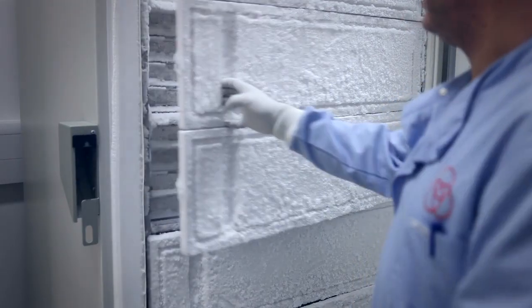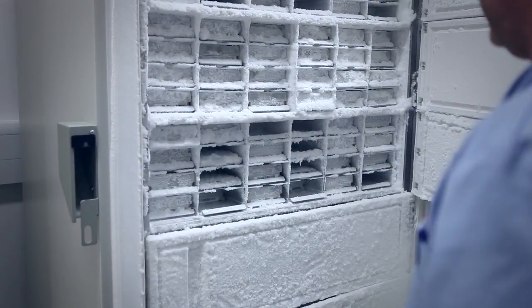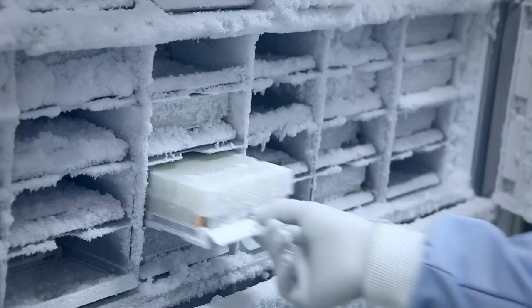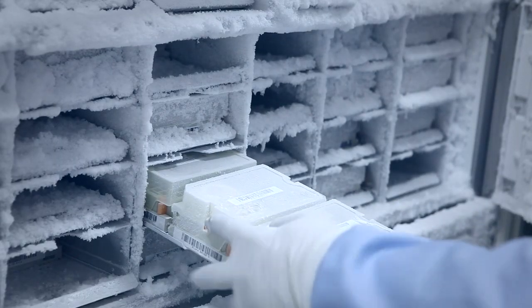Here's our freezer room. This is where we store the thousands of samples that we process. In this room we've got samples stored from over 100,000 people. It's worthwhile considering that we take one blood sample from someone, a patient. We will then divide that sample up into maybe 20 to 30 aliquots of DNA, plasma, white blood cells.